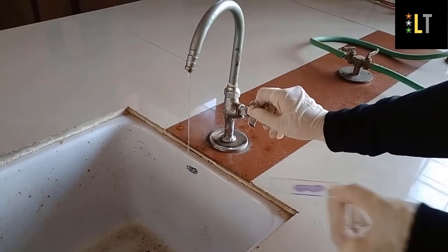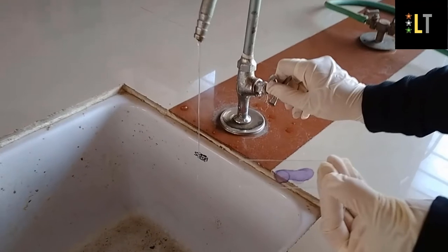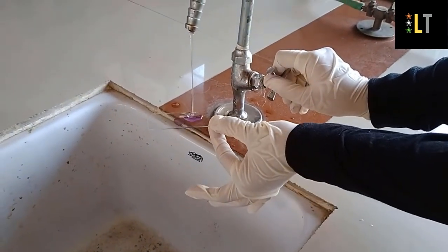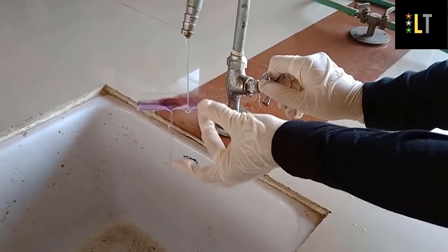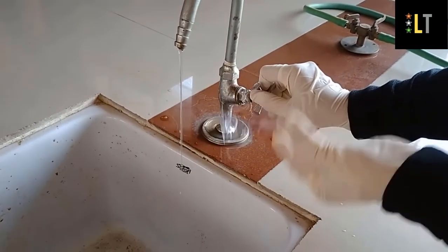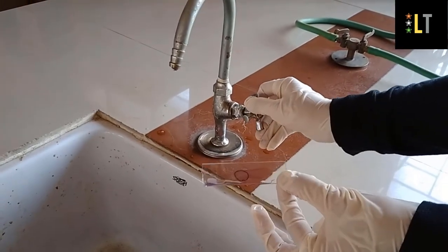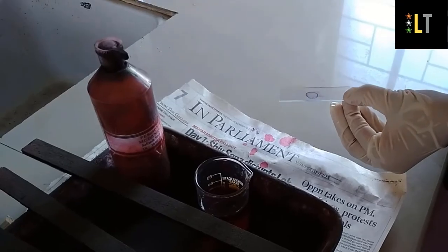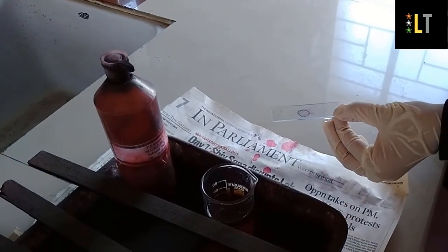So after 1 minute you can see that the stain has completely dried off. We will wash and remove the excess stain, and allow the slide to air dry. Now you can see that the slide has completely dried off.